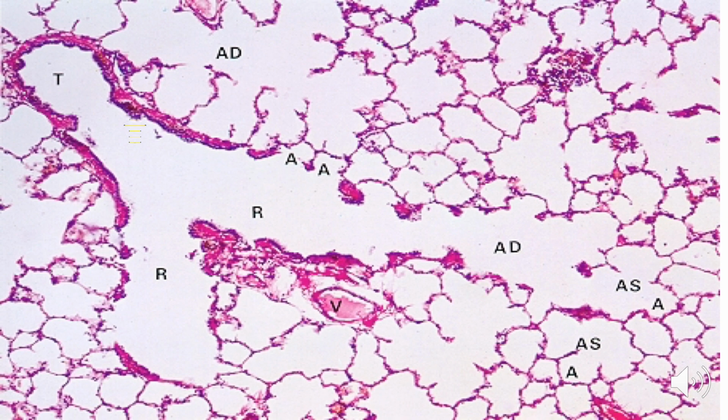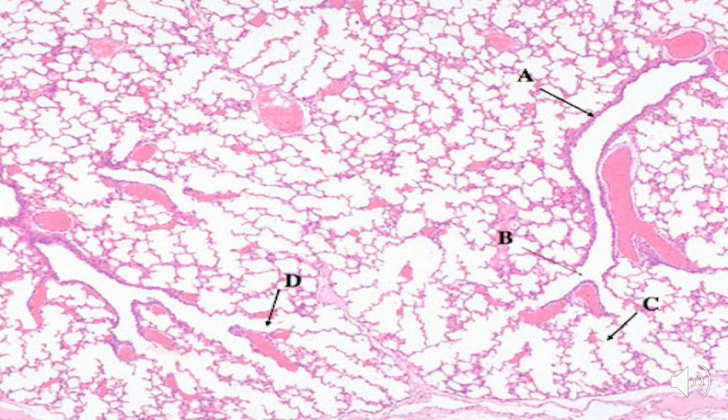Let's have another one. This is the terminal bronchiole. As you can see, its wall doesn't have any interruption. And then appreciate its bifurcation, which will now produce the respiratory bronchioles, those that are labeled with letters R. Blue arrow is pointing to the wall of the respiratory bronchiole. Red arrow is showing us an interruption. Blue arrow is pointing to the wall of the respiratory bronchiole. And this is another interruption in its wall. Can you identify the terminal bronchioles in the picture? Can you identify the respiratory bronchioles in the picture?